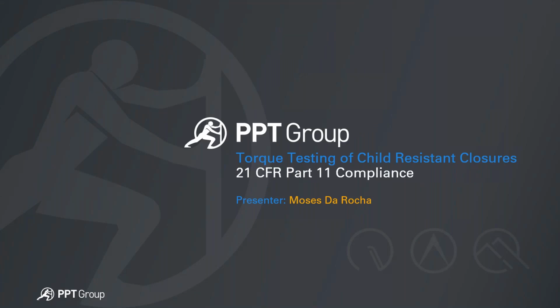Welcome everybody. We're thrilled to have you here for today's webinar, and we also include a live demonstration on torque testing of child-resistant closures, focusing on achieving FDA 21 CFR Part 11 compliance.